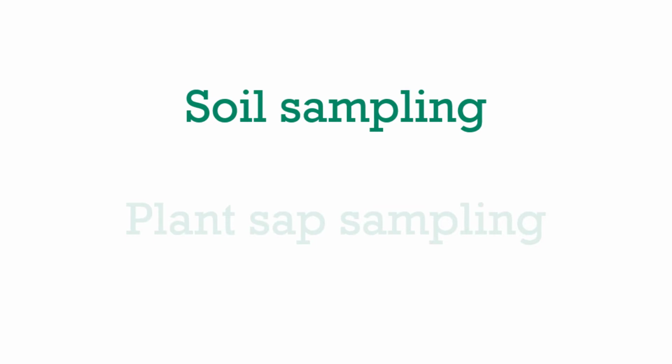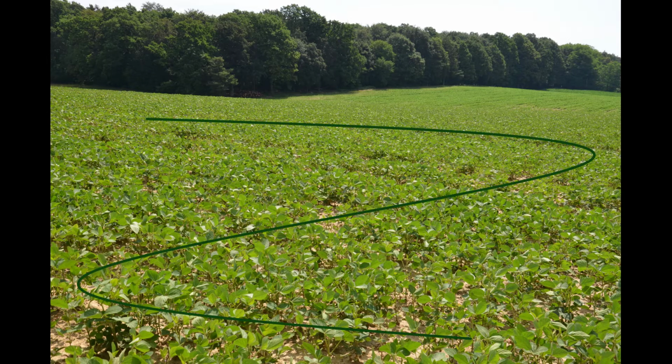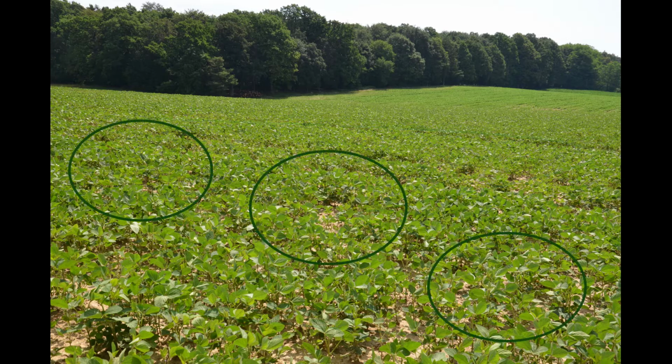Before you take the soil sample, you should know how you want to split your field, or if you want to do a mixed or a single sample. If you prefer a mixed sample, then you need to choose a pattern that represents your whole field. For single samples, you should look for smaller areas.